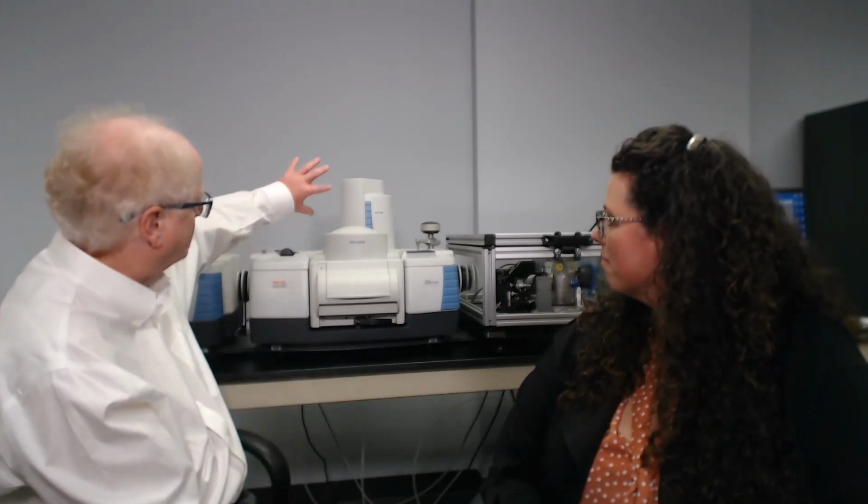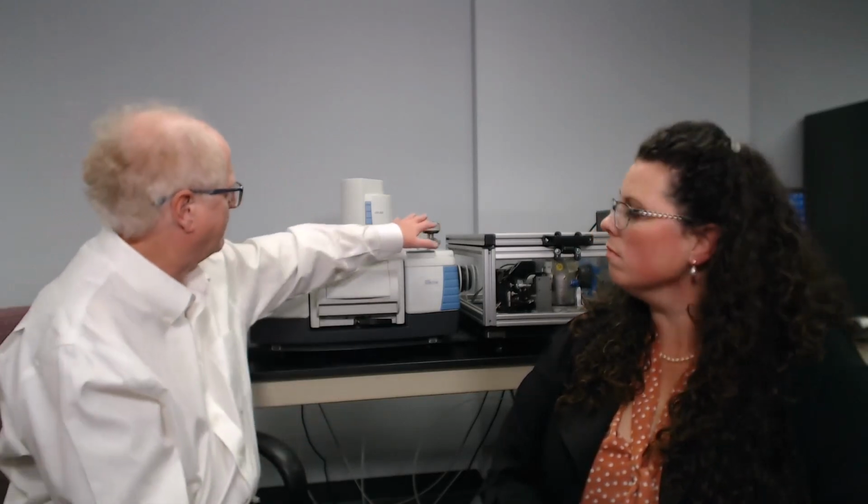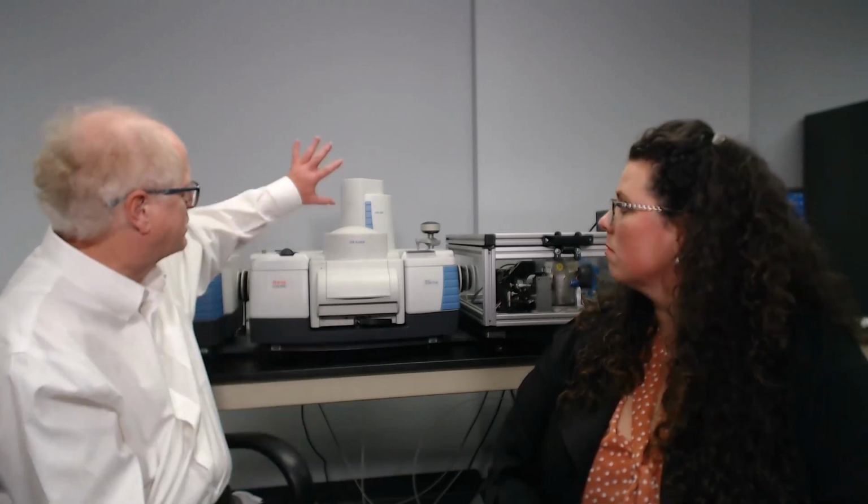So under here, you can have up to 3 different beam splitters. That gives us the ability to go from the far infrared all the way through to the visible. So you can go from below 100 wave numbers all the way up to over 25,000 wave numbers. So that was really the point of the automatic beam splitter changer, to integrate all of these tools. For instance, this built-in ATR is capable of doing far infrared analyses, but in order to do that, you need to have the right beam splitter. Well, there it is, right there on the beam splitter changer.